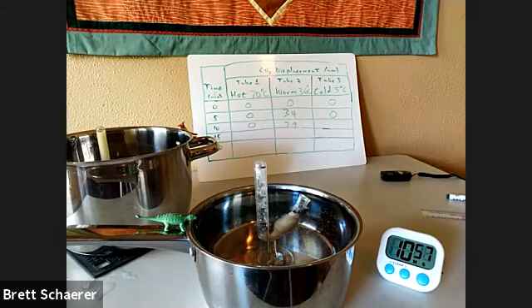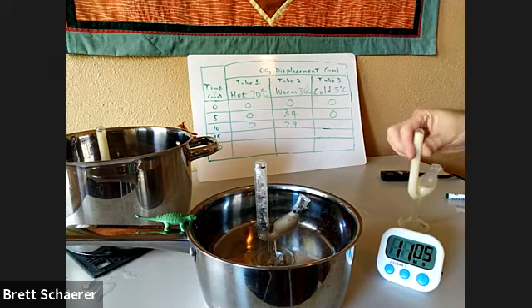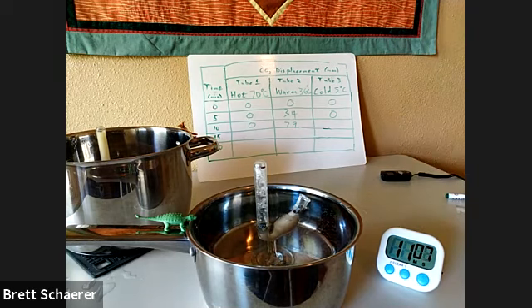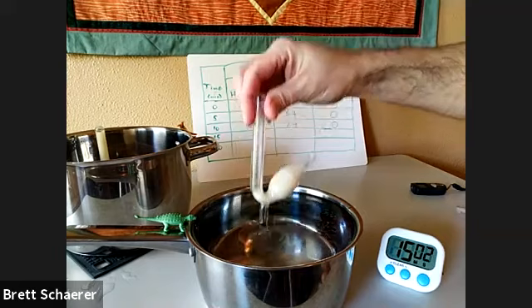And tube 3 in the cold environment. And that is also still at 0. We'll let these run for another 5 minutes. And I will pause the video again. Okay, we are at 15 minutes now.